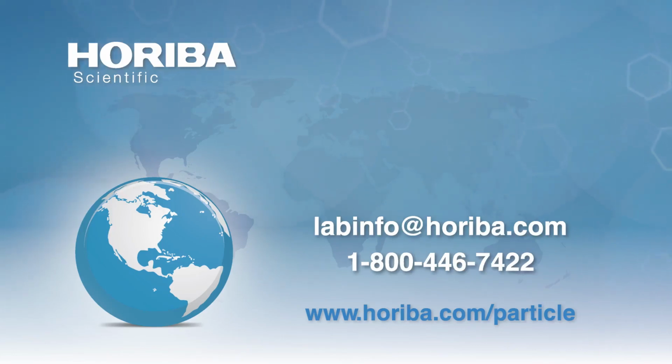Again, I haven't got time to go into all this, but importantly, you make it up at a constant concentration, and then you wait. They typically would wait 24 hours before they took a sample of the concentrate, and then diluted it into a solution at the same pH, pH 4, or pH 4 containing whatever ions you want to put in, or pH 4 and something else, okay?